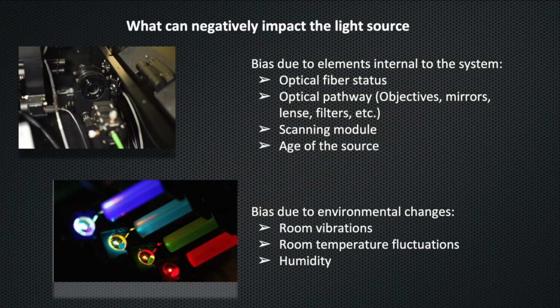Beware of sources of disturbance. Remember that the optical path of the excitation chain includes various elements that can interfere with the measurement. In order to obtain accurate, reproducible, and interpretable data, it is also necessary to take into account external factors that can affect the power and stability of the illumination. These include fluctuations in equipment and environmental temperature, direct airflow from air conditioning systems, changes in humidity, and instrument vibrations.